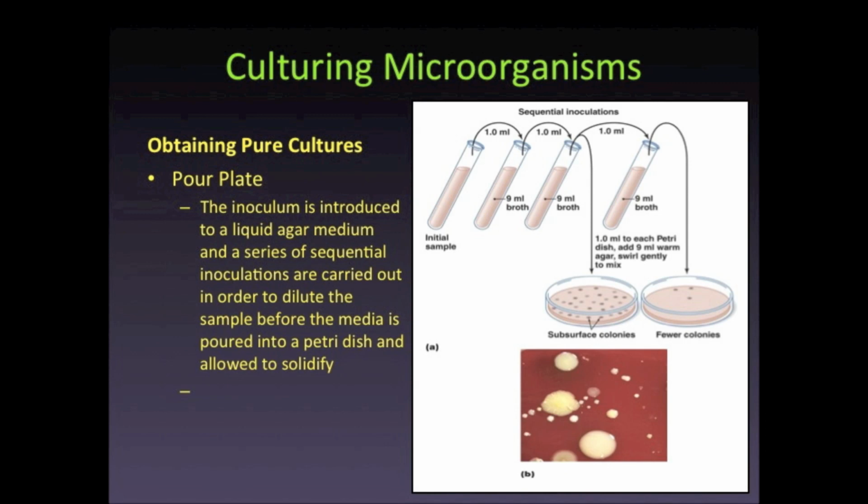Growth in petri plates following the pour plate technique is notably different from the streak plate. Because the bacteria are added to the medium and are mixed throughout it before pouring it in the plate, some bacterial cells may be found growing within the media and not on the surface alone. This technique can be useful in growing microaerophiles.